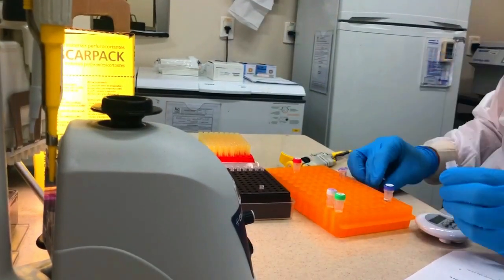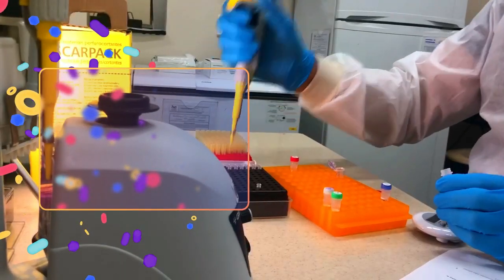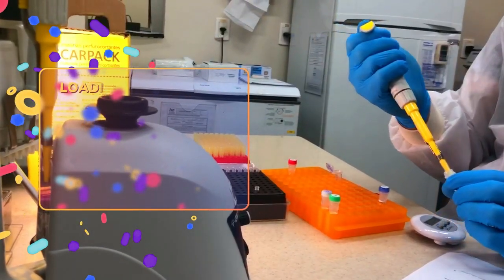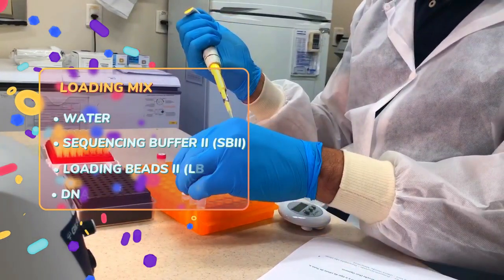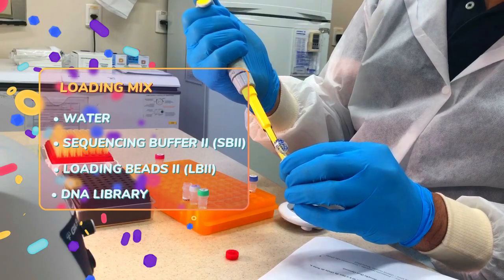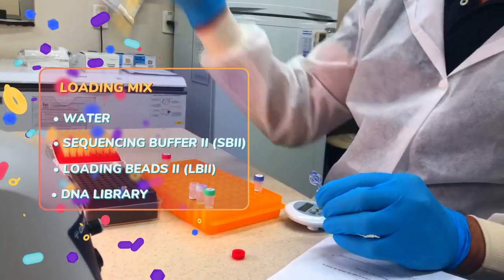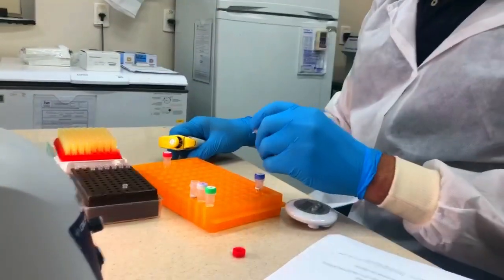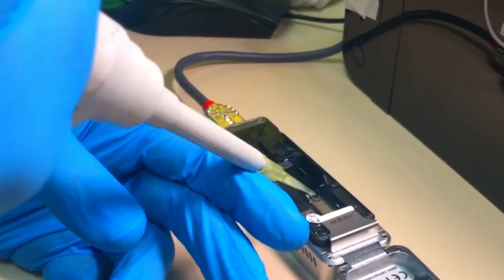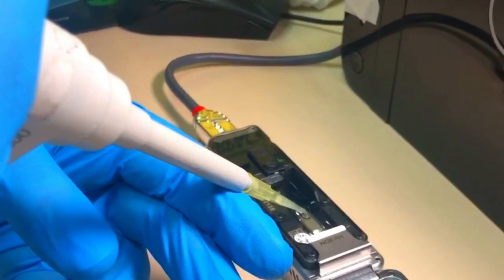During the incubation, prepare the library for loading. In a 1.5 milliliter tube, prepare the library mix by adding the following reagents: water, sequencing buffer (SQB2), loading beads (LB2), and the DNA library. Add the 75 microliters of library to the flow cell via the spot-on sample port in a dropwise fashion.